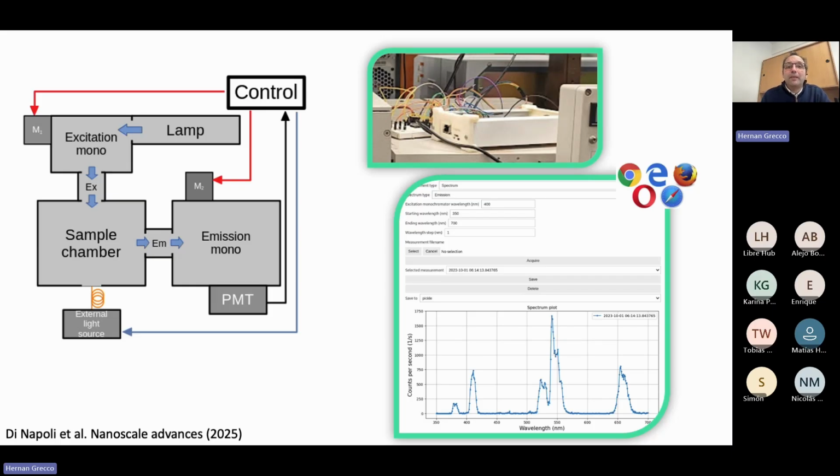By the way, here there was no information given by the company about the code, so we have to reverse engineer everything, right? And I would argue that one of the very important things that we need to learn from the open hardware movement is that we need to be able to access the inner workings of the devices if we're working in a lab, because we want to be able to tweak it, to maintain it, and to keep using it.